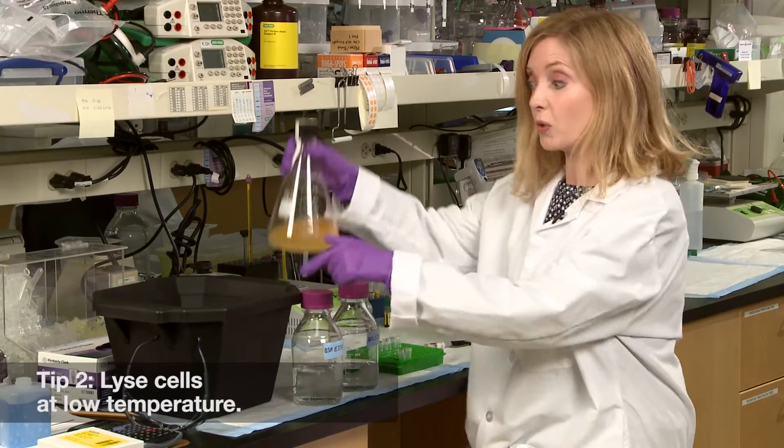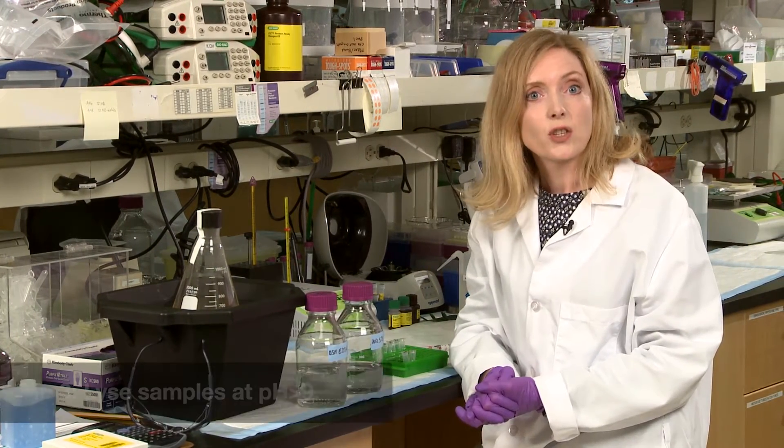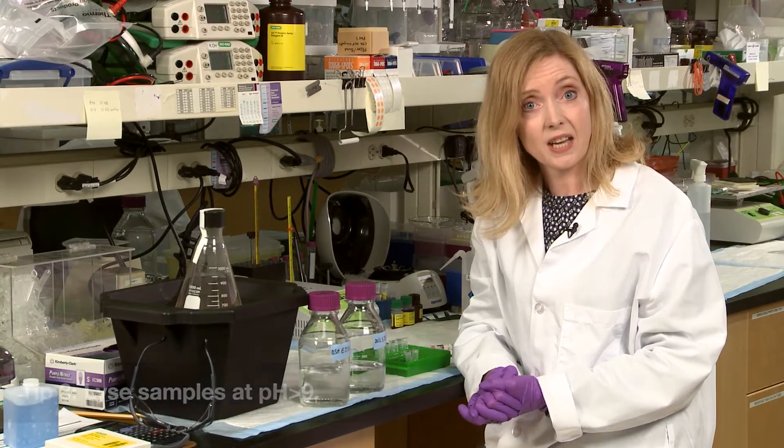Number two: perform cell disruption at low temperatures — you can use ice or work in the cold room to also reduce enzymatic activity. Number three: lyse your samples at pH 9 or greater, because proteases are often less active at basic pH.